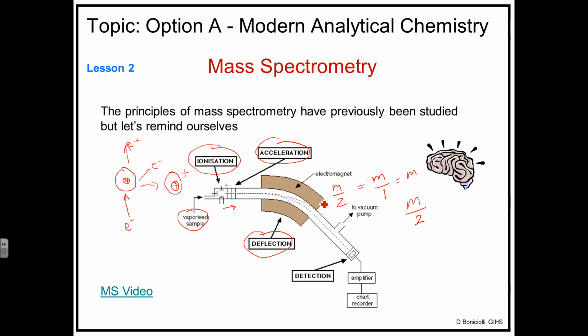As we proceed through to the last section of the mass spectrometer, we'll have a closer look at what happens in there. You can see there are 3 beams, the red, the green and the blue. Obviously the red particle is the heaviest because it continues on to the outside edge of the mass spectrometer. The blue particle is the lightest because it's deflected most by the magnetic field. The green particle is of intermediate mass, and that continues on to the detection region of the mass spectrometer.